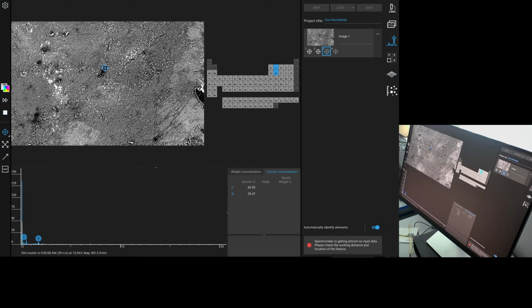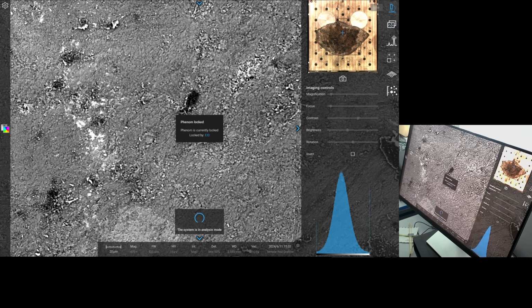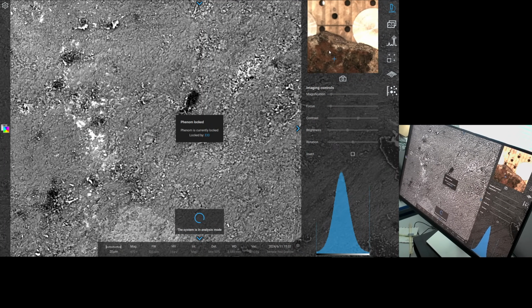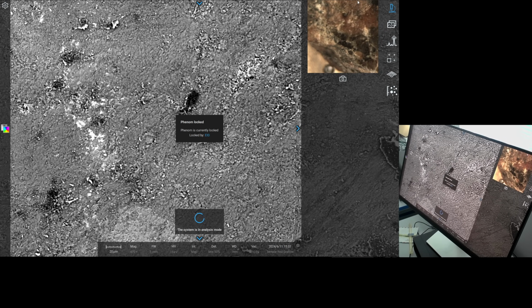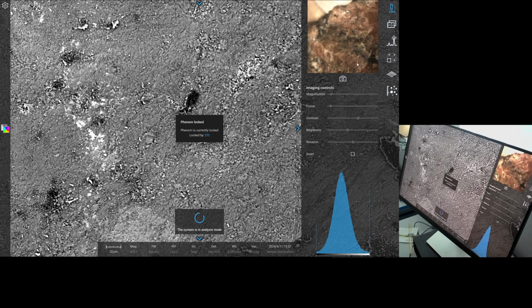Well, that just looks like a deposit of carbon. No, now it's thinking it's silicon. It's so close to the detector it cannot really see it. I suspect it's mostly carbon. Possibly an organic deposit or carbon. Why would that be there? Well, let's look at the break area. So this is on the top surface, but we'll have a look at sort of these broken areas here. Should get a good readout of what the elements are.